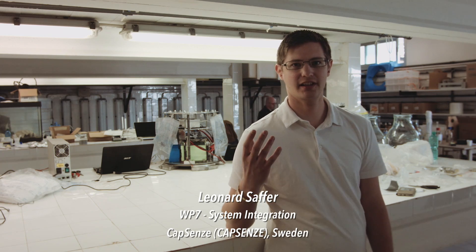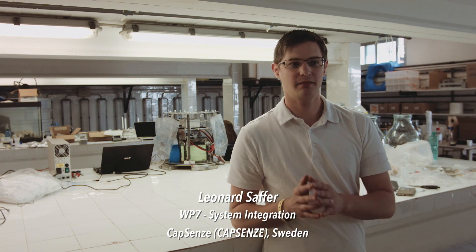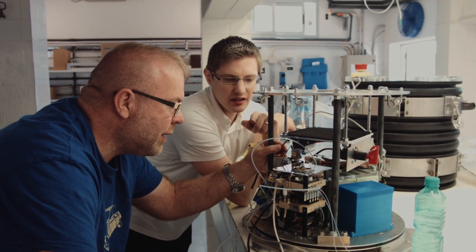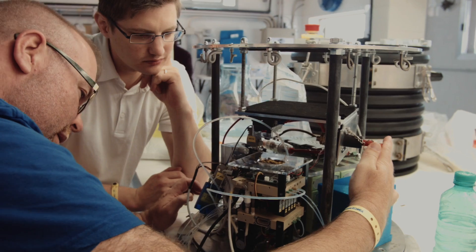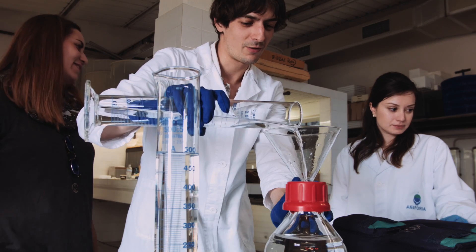I'm working with the biosensor on the integration of the different components, meaning the different work package groups do their own work and I make sure it all fits together. We at CapSenze have also been developing the outer housing, the batteries, the cooling tank for antibodies, and several other components that go into it.